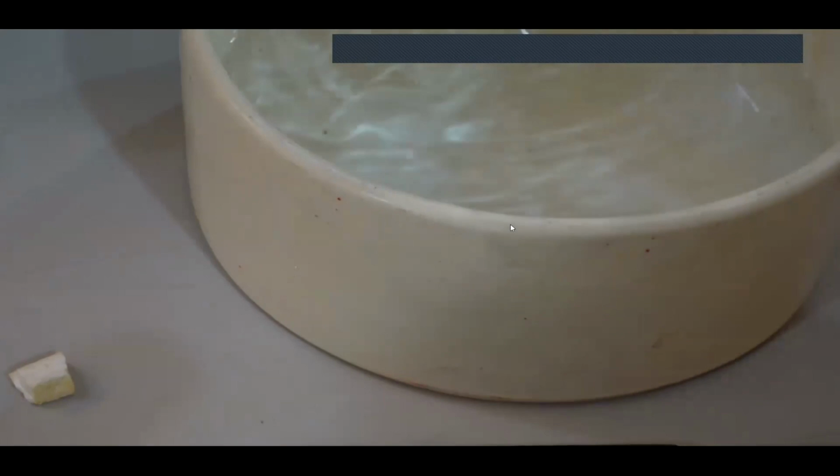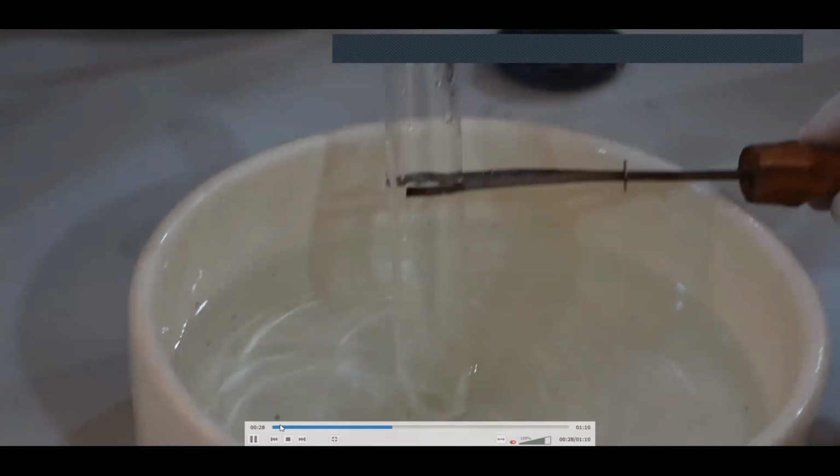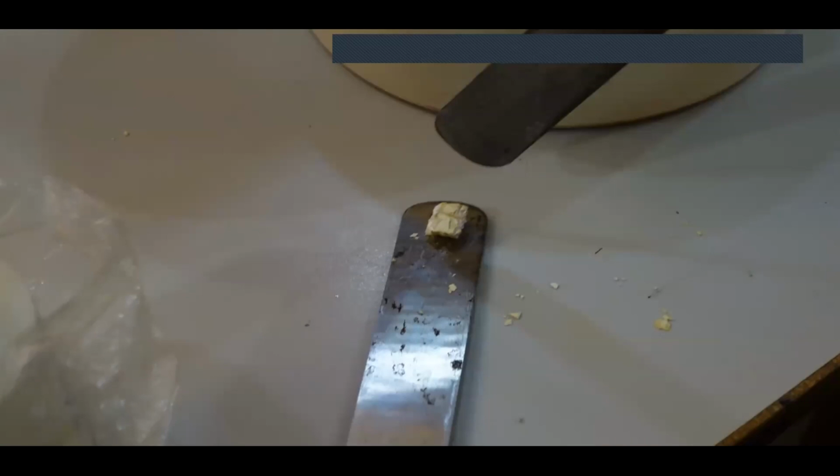So, okay, here we go. I've closed it again because I don't want oxygen to go in there. And this is water. I was just getting it ready for the reaction. Now here I have that piece of sodium, and it's a metal, but it will behave in ways that we don't really expect metals to do.